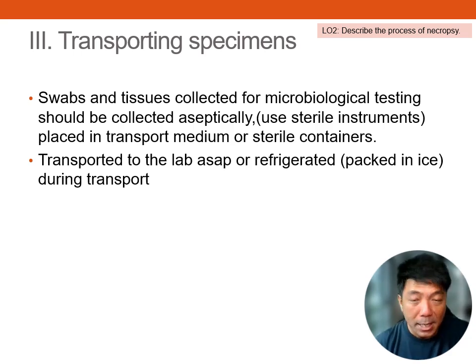During necropsy, you will collect various tissues and fluids for microbiological testing. It's important to collect these specimens aseptically to avoid contamination. Transport them as quickly as possible to the lab, using ice packs or refrigeration if needed, to preserve the sample until analysis can be performed.